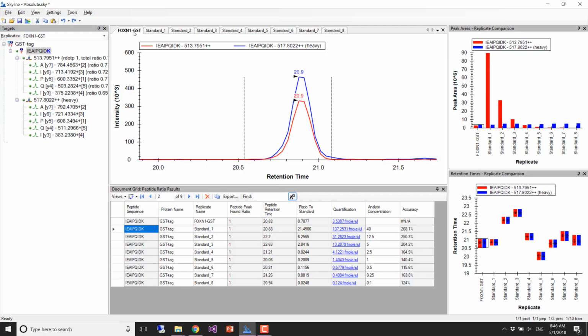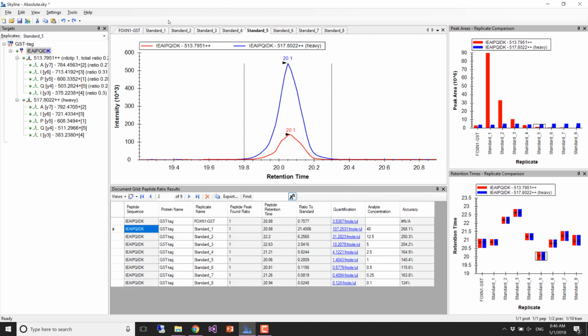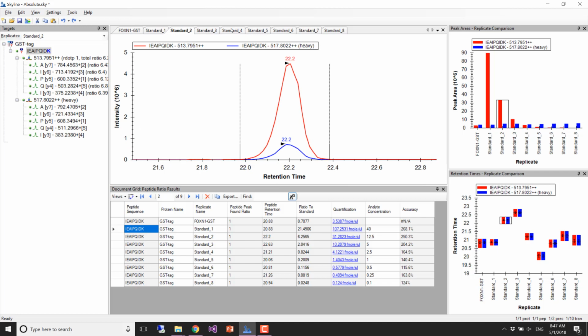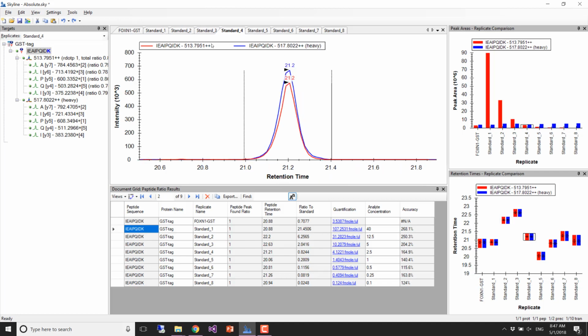So if you were going to estimate now, what would you estimate? We're down from 4 to 3.5 to, okay, well, it's less than standard 4. Standard 4 only has 2.5, so what's your guess? Maybe 2, right? It's maybe a little bit less, or it's certainly closer to 2 than to 4. Okay, so that's what we'd like to do. I'm just showing you, imagining where this is going to be based on what you see in these other samples. Now we're going to go define a curve.